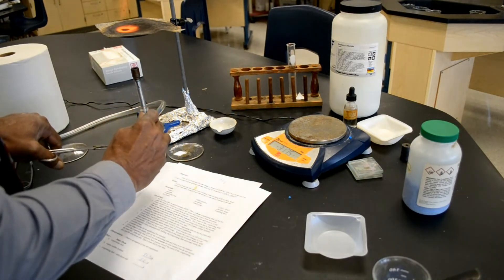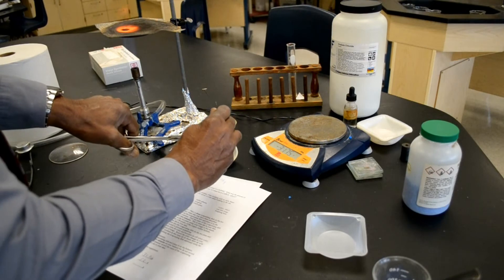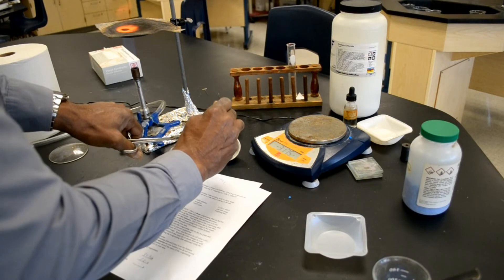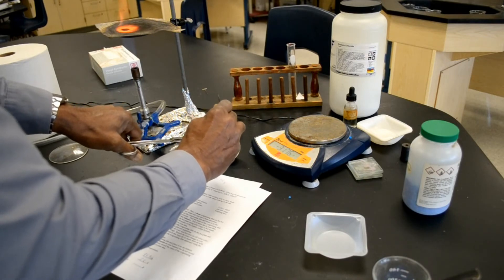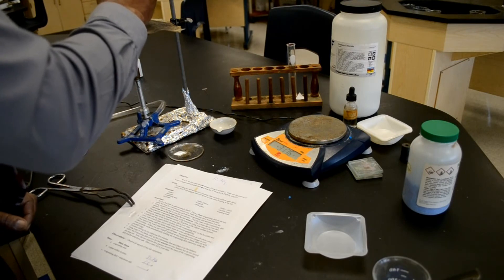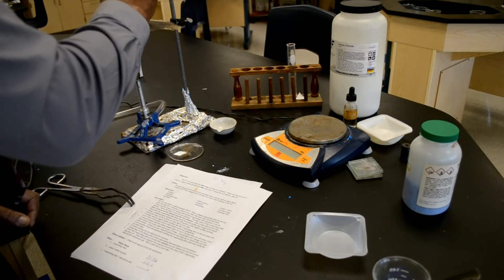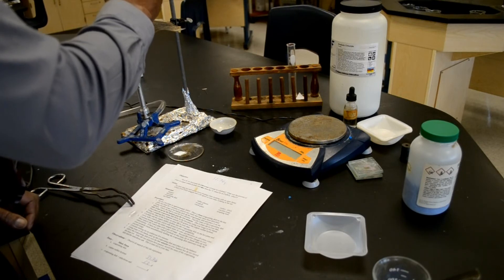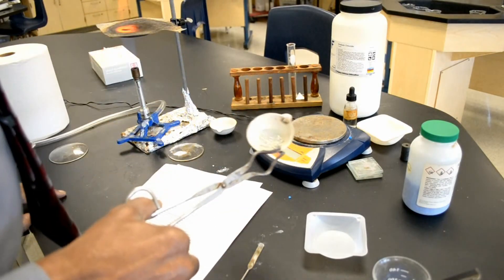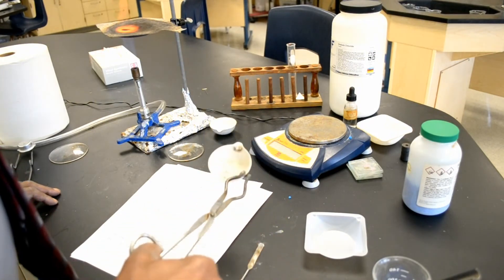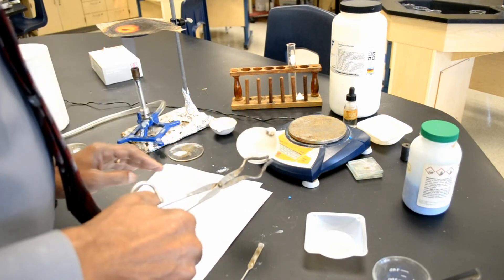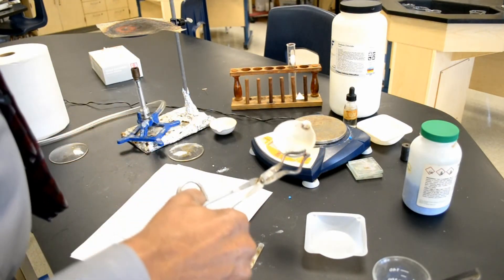You can see it's turning really white now. But all the hydrate is not broken up yet. I've got to continue to break this up. I'm going to continue to heat this. As you can see, the entire sample is an off-white color. Might as well turn the Bunsen burner off.